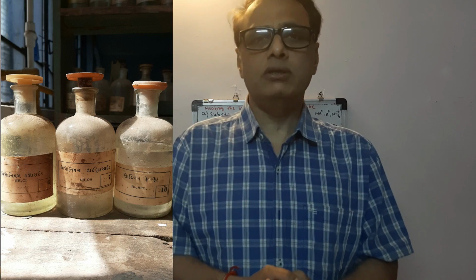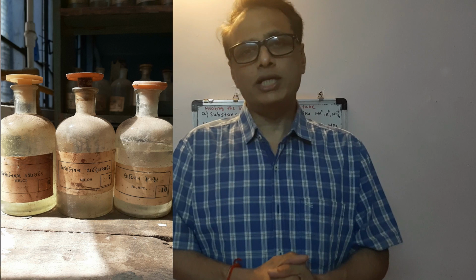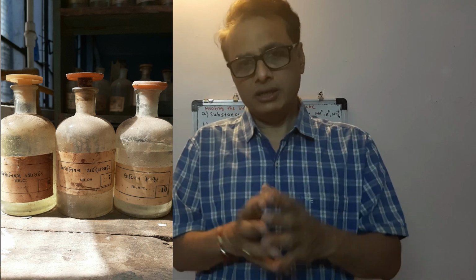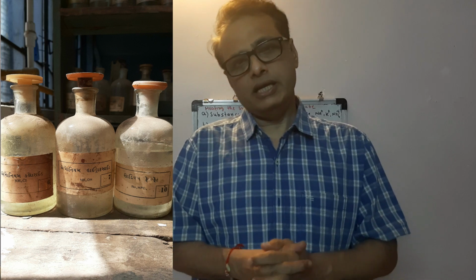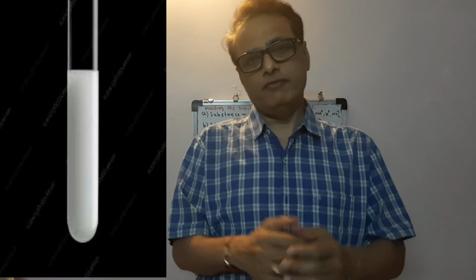Suppose if we don't get precipitates in the fourth group, then again we have to take original solution. We have to add NH4Cl, NH4OH and Na2HPO4 in the test tube. And if we get precipitates as a phosphate, then fifth A, that is magnesium, can be present.